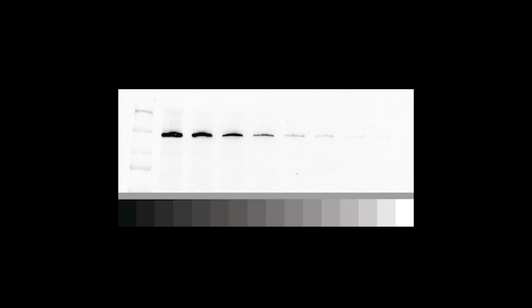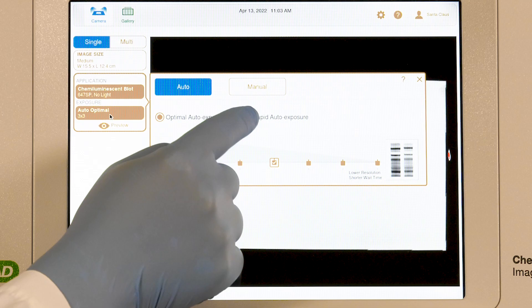In some cases, the software will combine data from multiple exposures, resulting in an image with a greater dynamic range than a single exposure. Although the optimal auto exposure setting may take longer, the resulting images have the greatest dynamic range with no saturated pixels, perfect for quantitation.